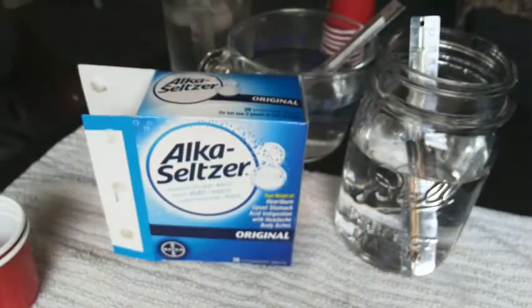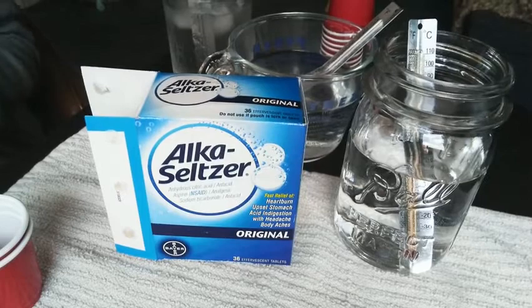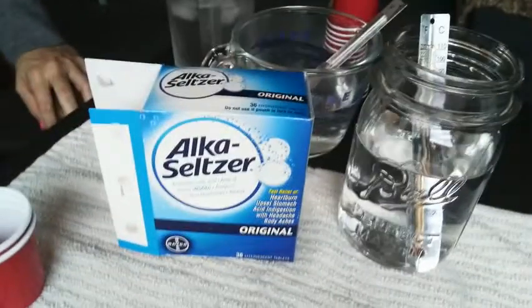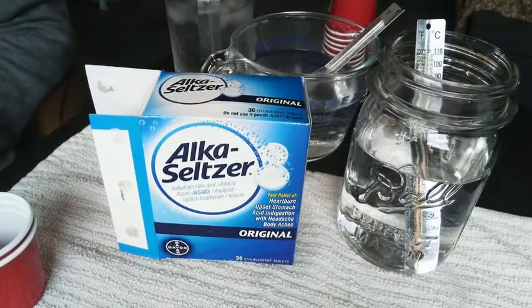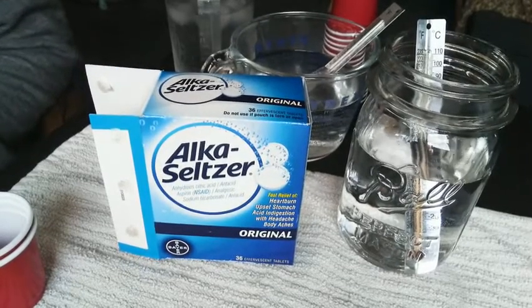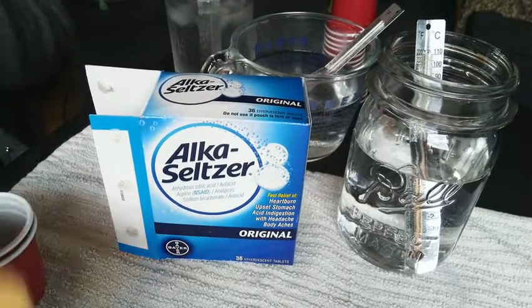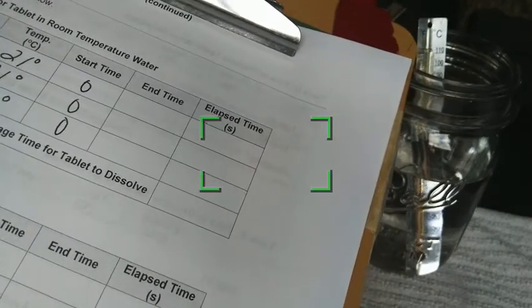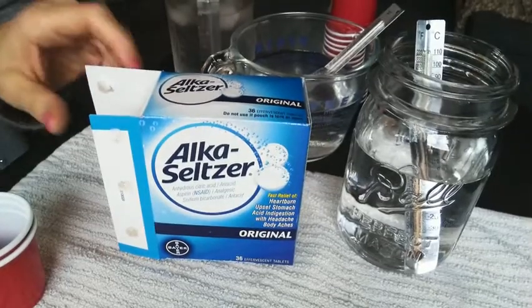So we're going to do 3 separate trials, and we're going to record the elapsed time for all 3 trials. Now, honestly, I'm going to use a stopwatch. So the start time is going to be 0, and the end time here, whatever the stopwatch is ending at, we're going to end it when the entire tablet is completely dissolved. Okay, that'll vary from trial to trial.